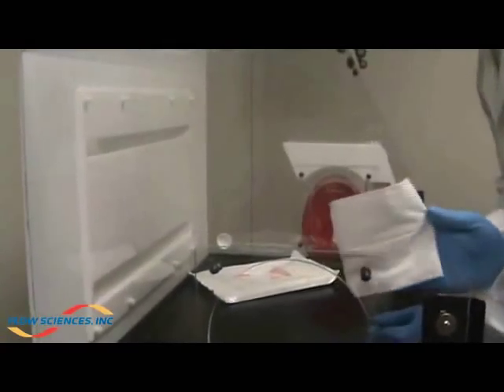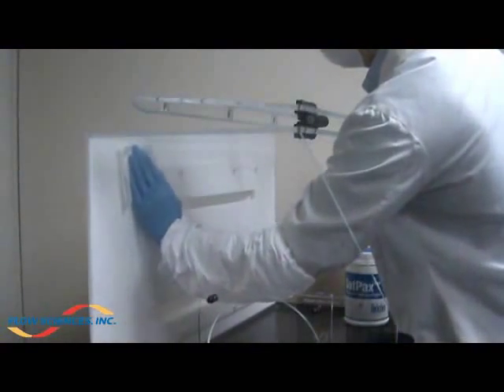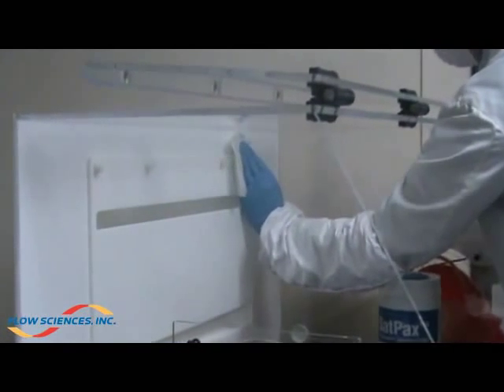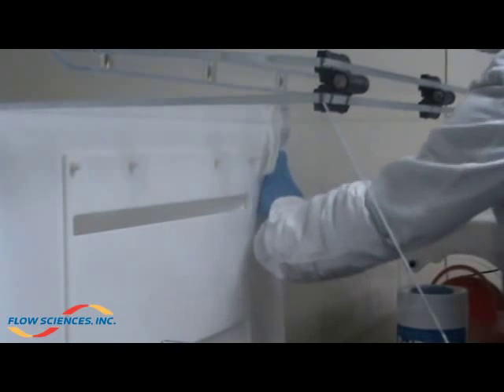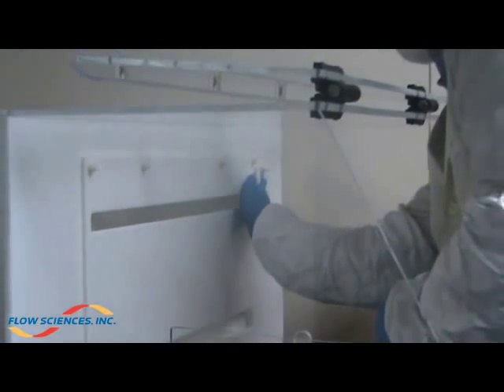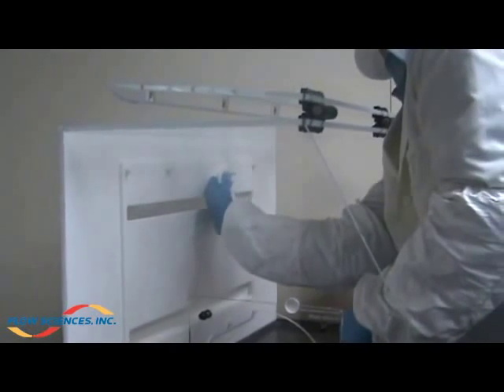In the same manner, clean the back wall and plenum from top to bottom using single strokes, reorienting wipes, and overlapping each stroke by ten percent.